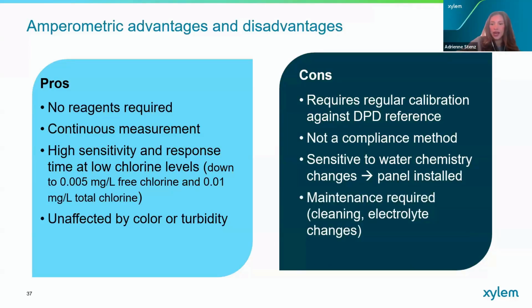And finally, they do require periodic maintenance. The membrane and electrolyte must be replaced on a schedule. The sensor must be repolarized occasionally, and the gold electrode requires periodic cleaning and polishing.